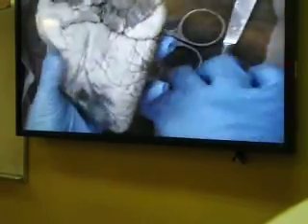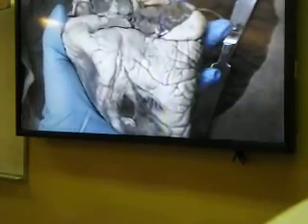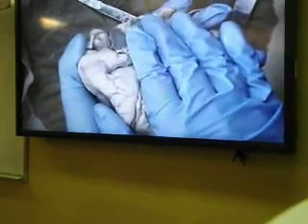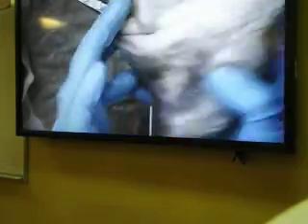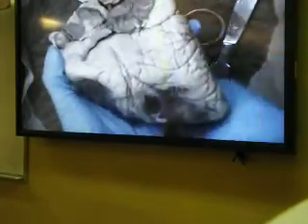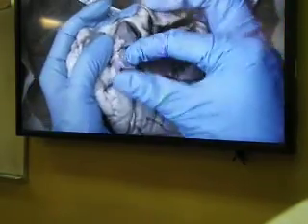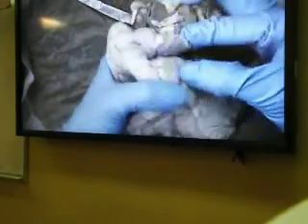Alright. Once I understand that, then I have to understand the blood vessels. From the anterior aspect, we only look for arteries to identify when we are looking at the sheep heart, and on the posterior aspect we look for the veins. So I want to go all the way right here to the base on the anterior view, and the most anterior artery I see looks a little bit purplish, a little bit light purplish.